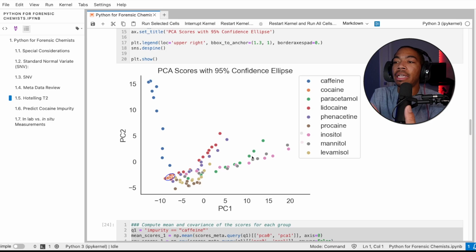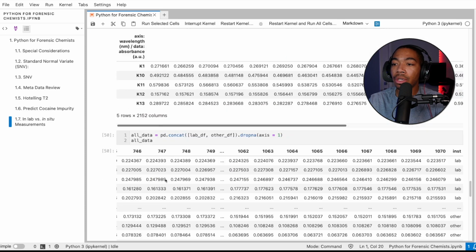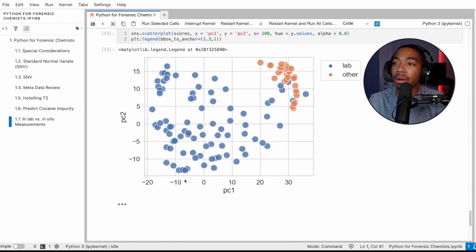So we are still expecting this sort of outward expansion of our data set, which is not existent anymore with the SCiO data, and largely because we're looking at a relatively small wavelength range of the data. And here perhaps is where there isn't much information there, at least relevant to that original pattern.